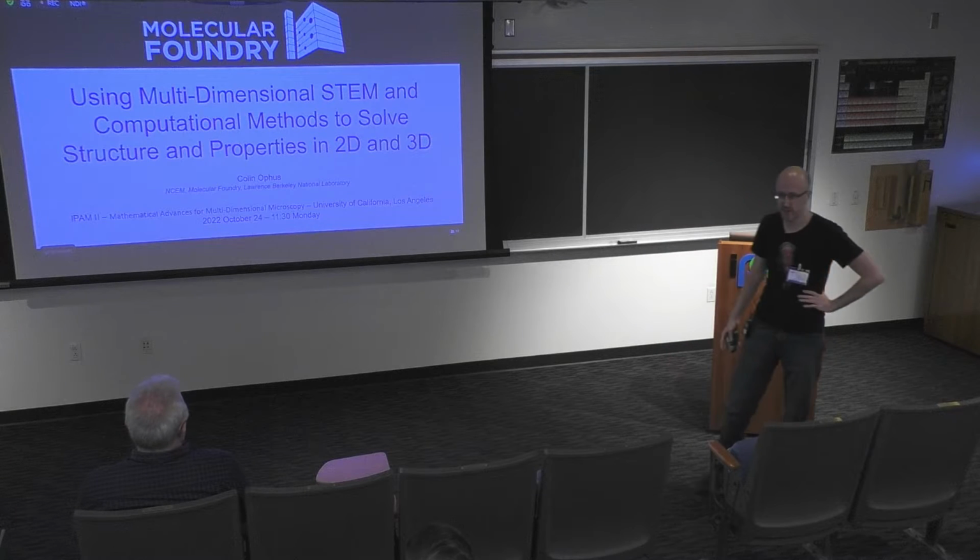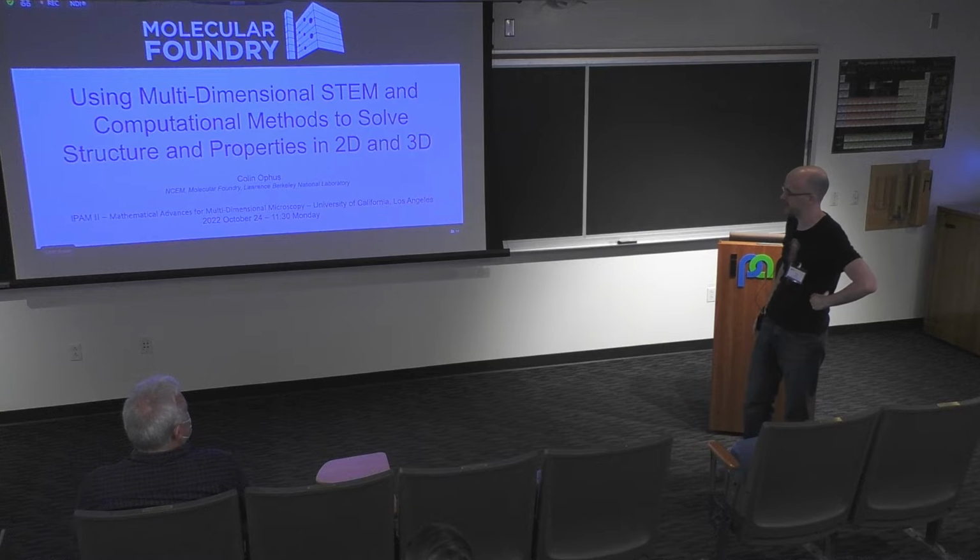I'm going to talk about a grab bag of topics that I thought this audience might be interested in. I'm going to introduce you to the instrument that we use, the scanning transmission electron microscope, and specifically the 4D variant that I'm going to talk about today. I'm going to give you examples of materials science, things that we can measure, properties like local orientation, strain, the phase of the material, etc.